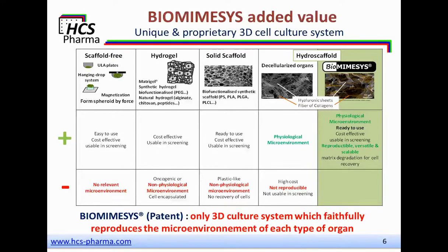Among the advantages of this system are their cost and the adaptability for screening, but their need of preparation before use and the bad diffusion of growth factor and/or oxygen due to the encapsulation of cells, added to the model being oncogenic or a non-physiologic microenvironment, are the major limitations of the system.